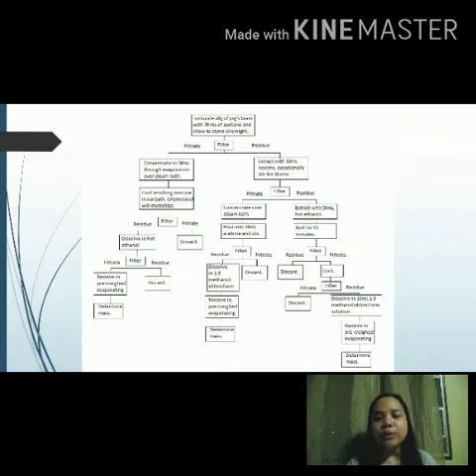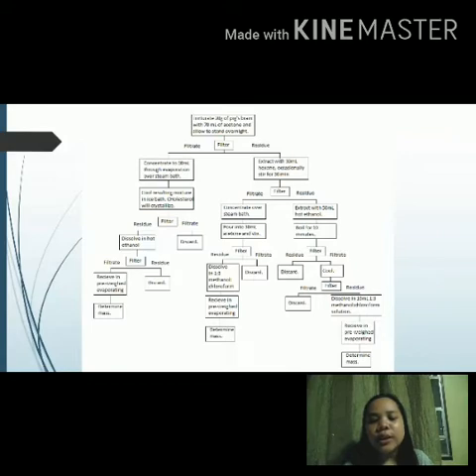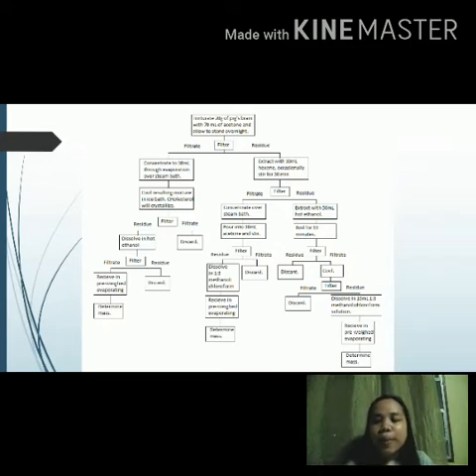So, what we did first is we triturated 20 grams of the pig's brain with 20 ml of acetone. It was then transferred to an Erlenmeyer flask and was added with 50 milliliters of acetone and was allowed to stand overnight in the refrigerator. The purpose of which is to successfully recover lipids and eliminate non-lipids by the acetone reacting with non-polar lipids through its polar group and also reacting to lipids with its non-polar group.